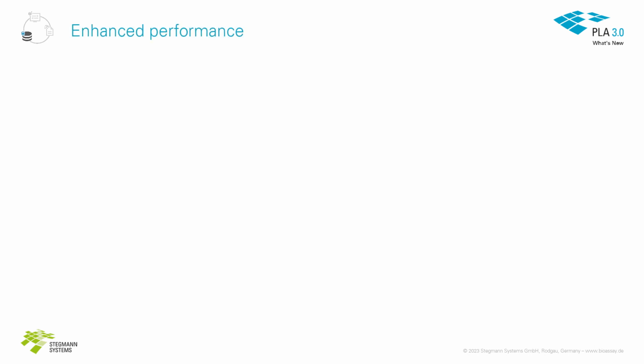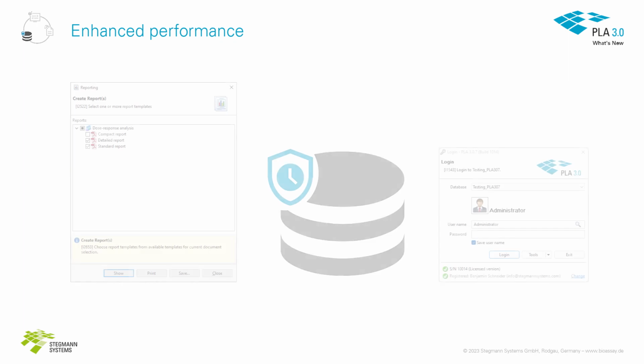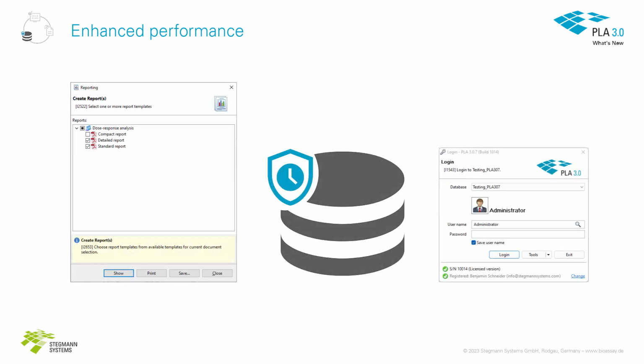Speed up your workflow even more with PLA 3.0.7. Performance was enhanced in several areas: the overall usage of system memory, when generating reports, and when accessing the database.